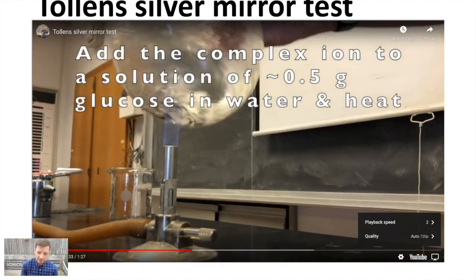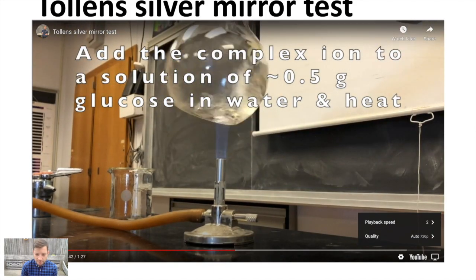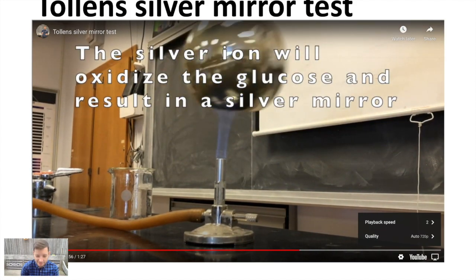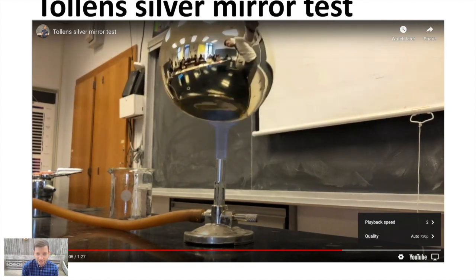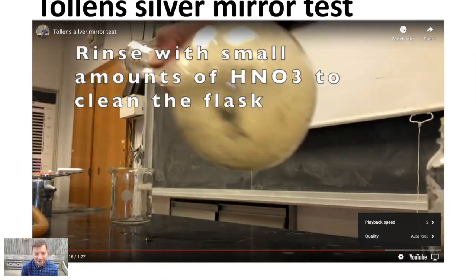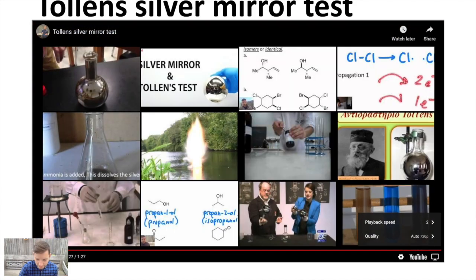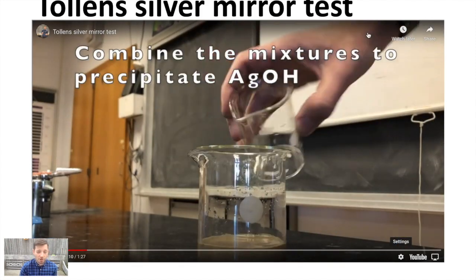And then when you react the Tollens reagent with any substance that contains what's called an aldehyde, you get a positive result. In this case, you get a silver mirror, and there it is, coating the inside of the flask. Very reflective, shiny silver mirror on the inside of that flask. To get the flask back, you can oxidize the silver with nitric acid, and then that actually turns it back into aqueous silver ion. So that's a very old-fashioned test, but still used a lot in the laboratory to detect whether or not you have what's called an aldehyde.